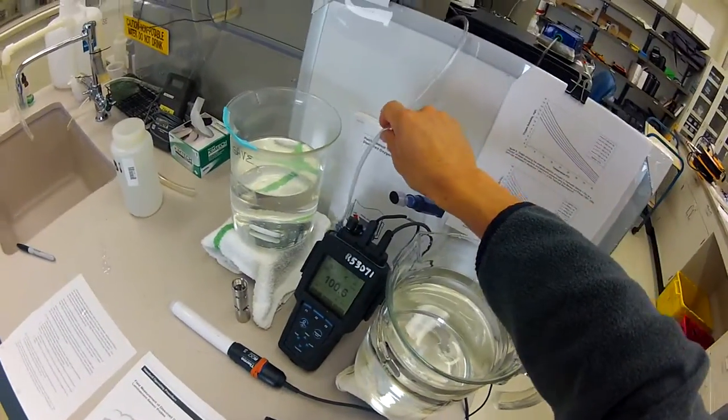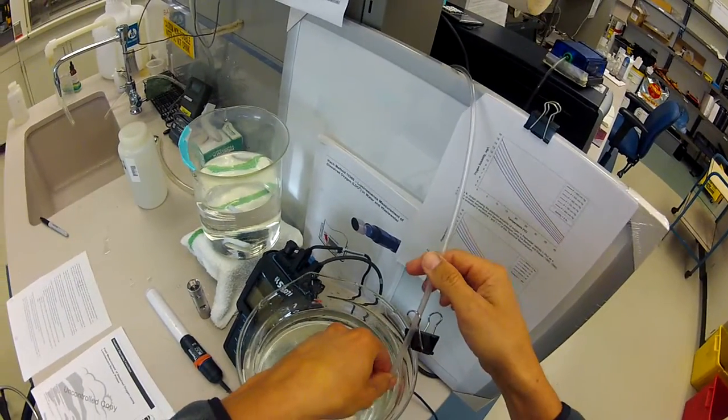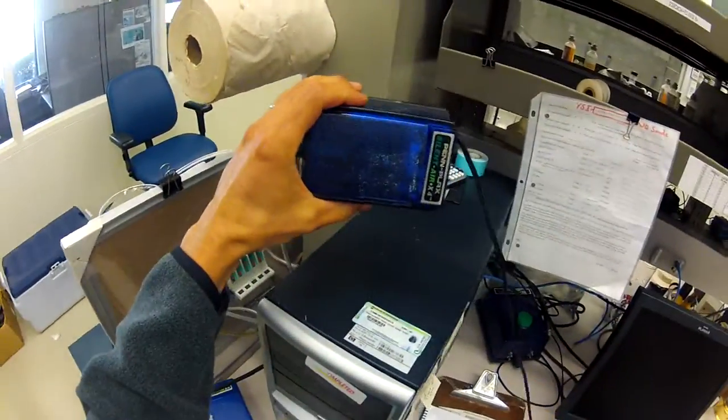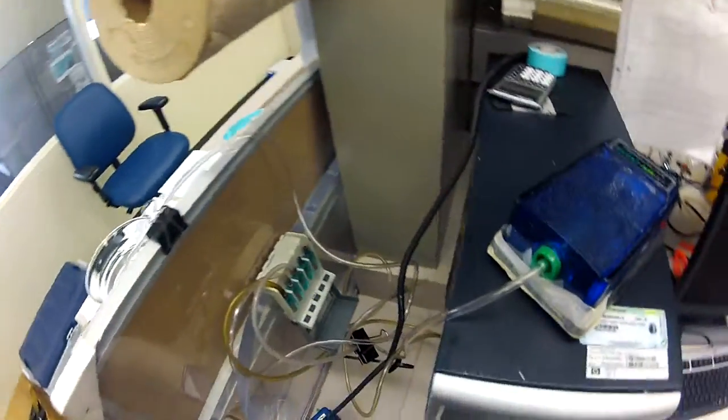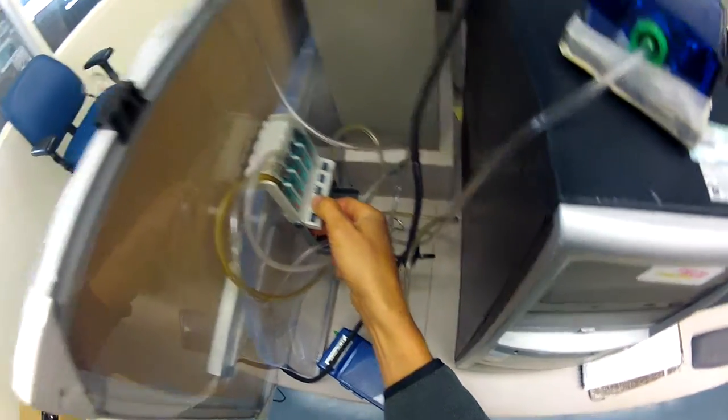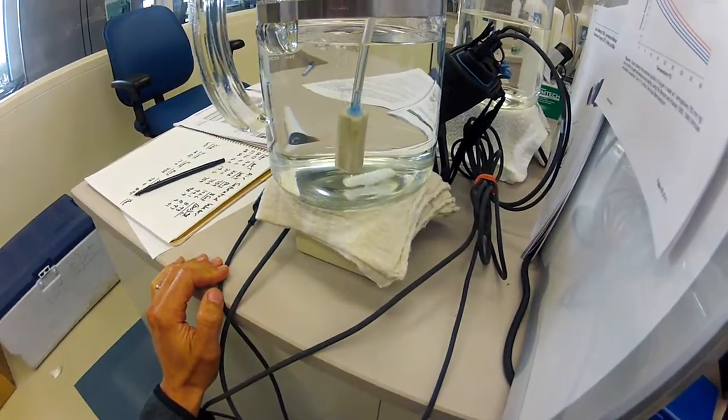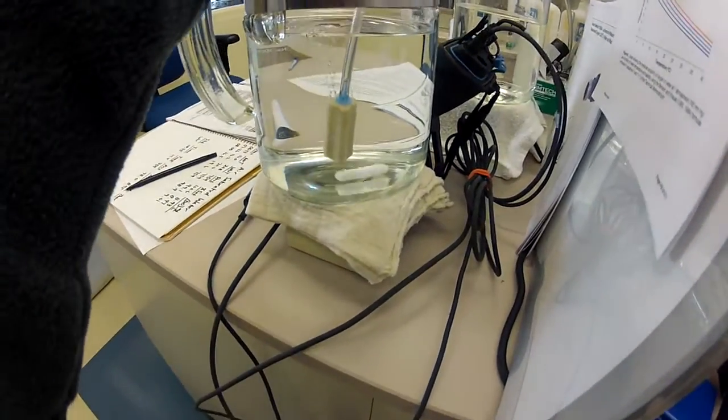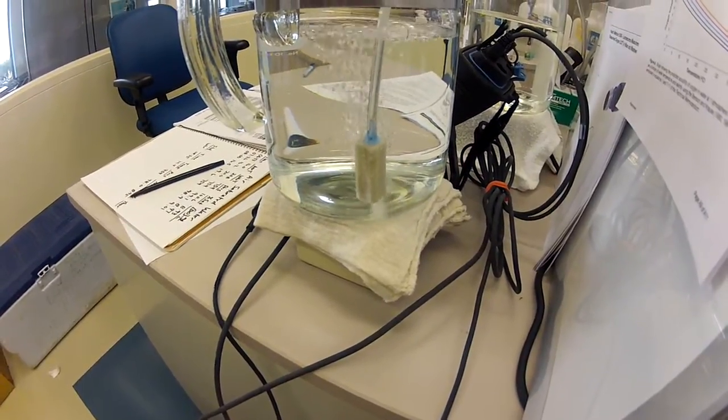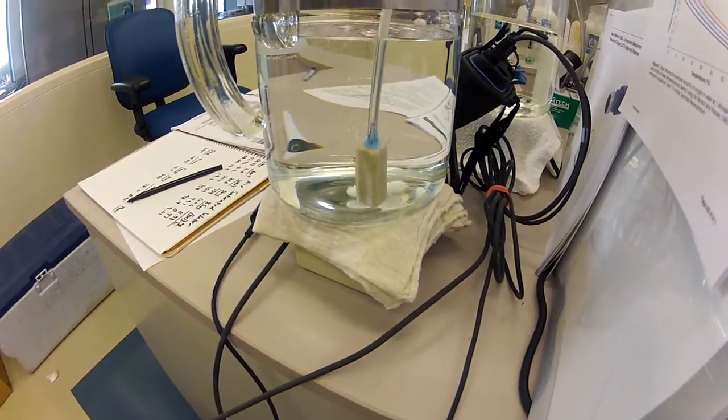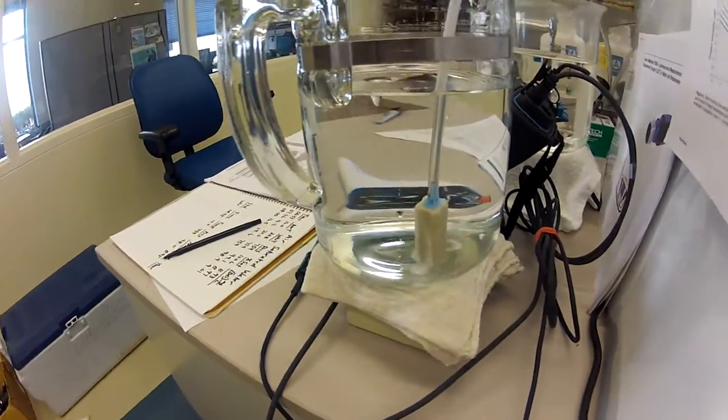Then I'll set up my aquarium pump with a diffusing stone. This is just a basic aquarium pump, nothing special about it. But I do use a little regulator here to help control how much air is blowing through. Too much air, if it's really cranked up, totally open, there's a good chance you're going to supersaturate. Ideally, you're going to be looking for just a steady stream of air.